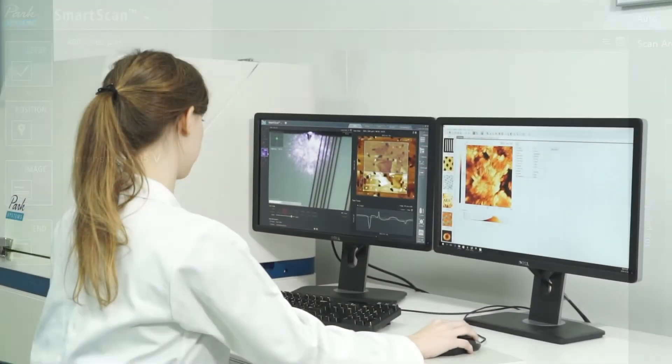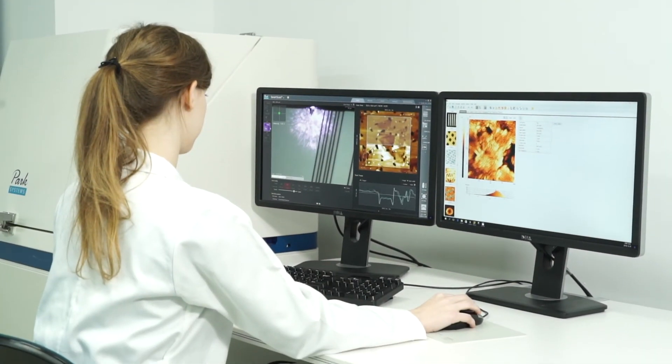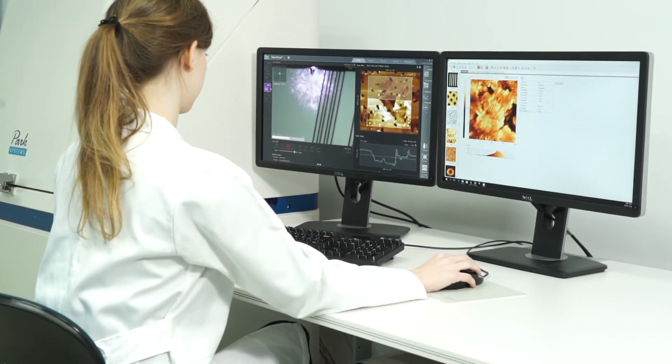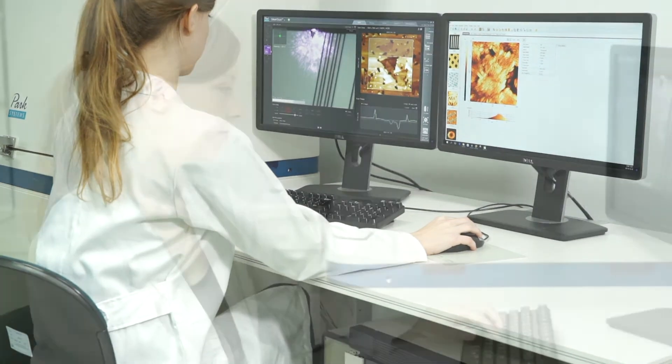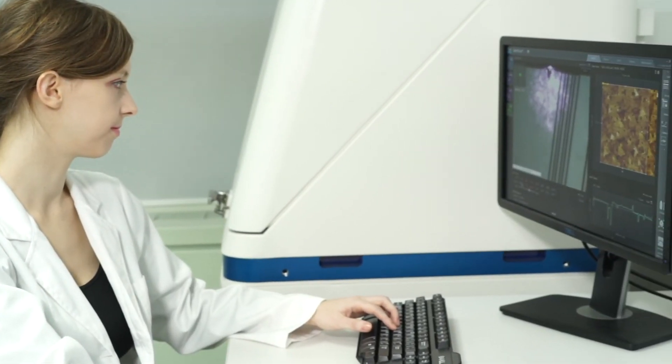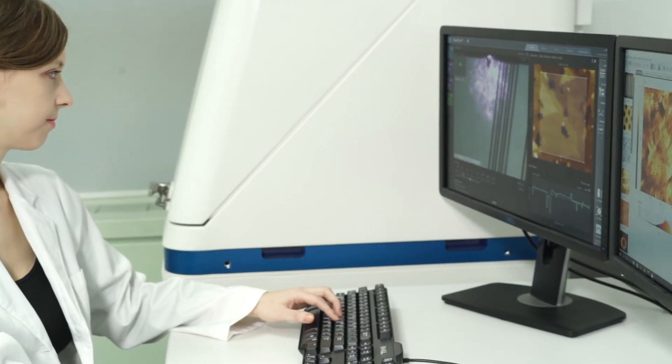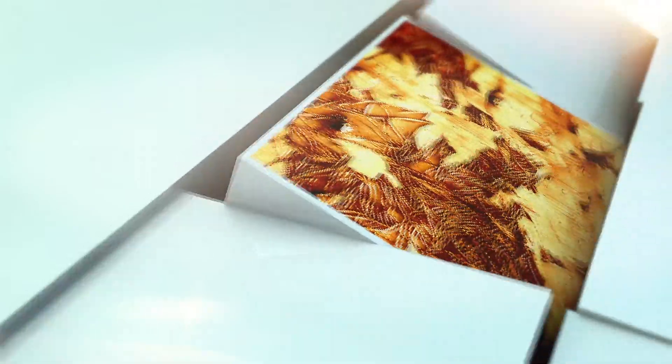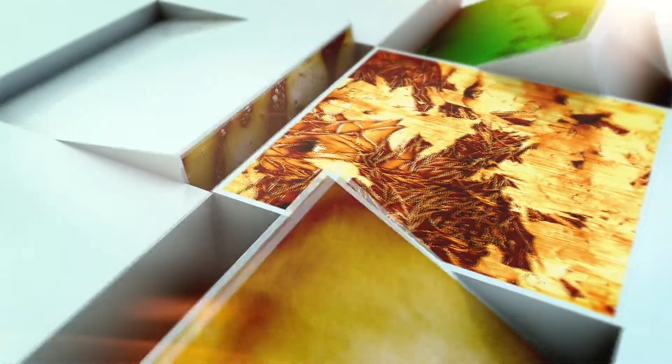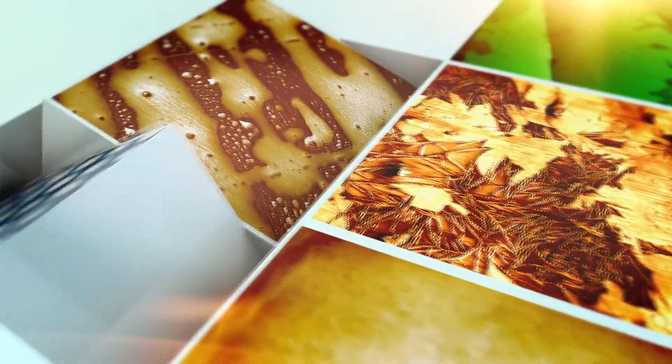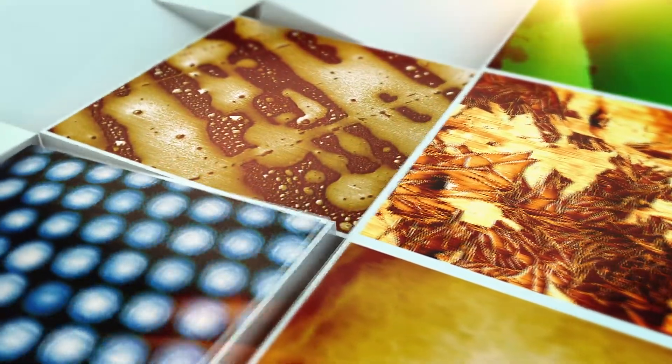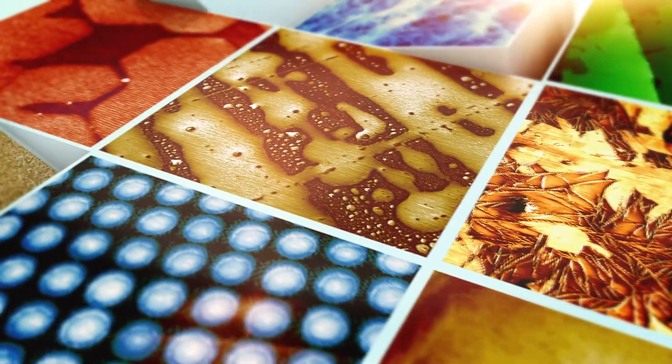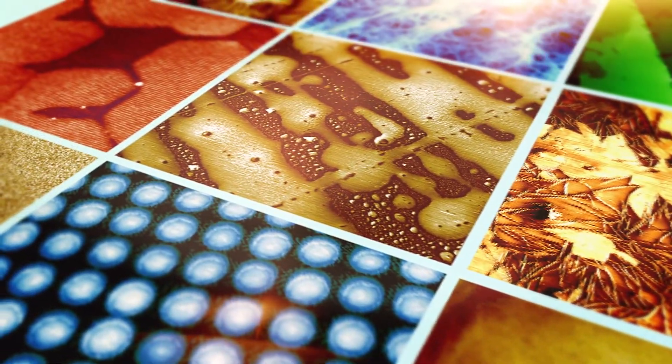Together with a fantastic Z-Scanner feedback speed and optimized Z-Servo control built into our cutting-edge NX Series AFM hardware, ParkSmartScan enables researchers to make nanoscale advances in applications requiring high-speed AFM measurements using nothing more than an ultra-high frequency cantilever.